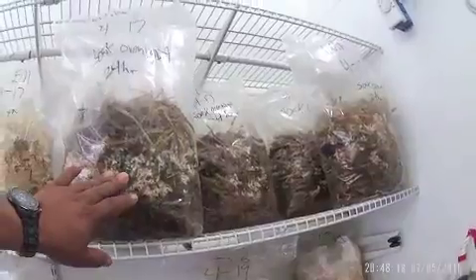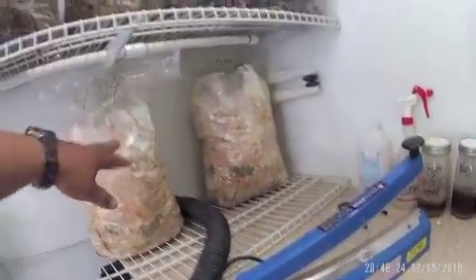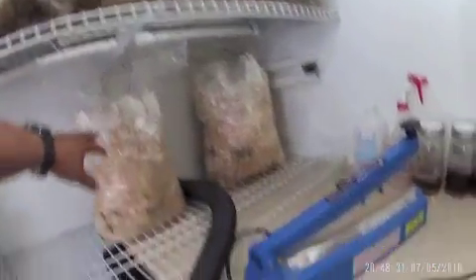I just got to double or triple the amount of spawn. Other ones will take off — like a 716 here. These have the equal amount of spawn, but you can see the difference: almost no growth versus almost full growth here.